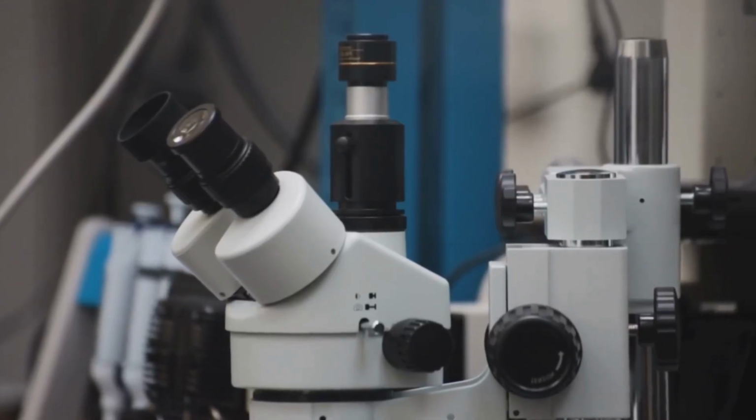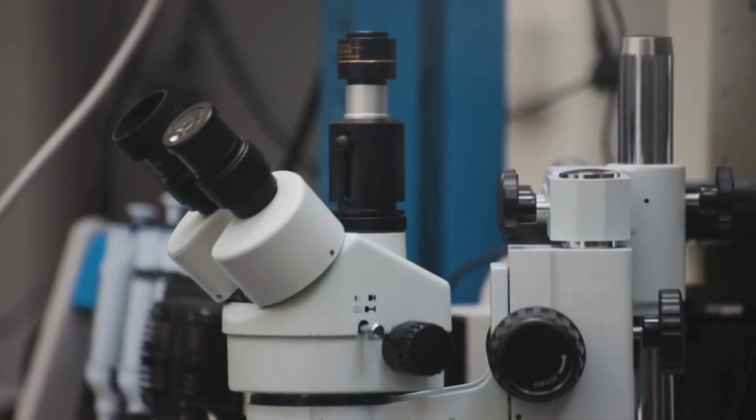Practical example, a human red blood cell. Under a good light microscope, you can see it clearly. A small, reddish, donut-shaped disc. You can see its shape and size, and watch it move in a live sample. Under an SEM, you see the surface in 3D detail. The smooth, concave curve becomes visible. With TEM, you could slice through it. No nucleus or mitochondria, just hemoglobin. Each microscope tells a different, equally important part of the story.